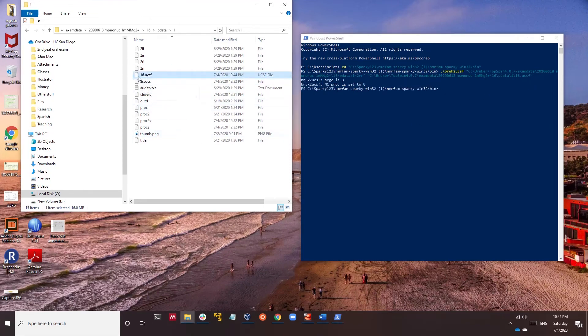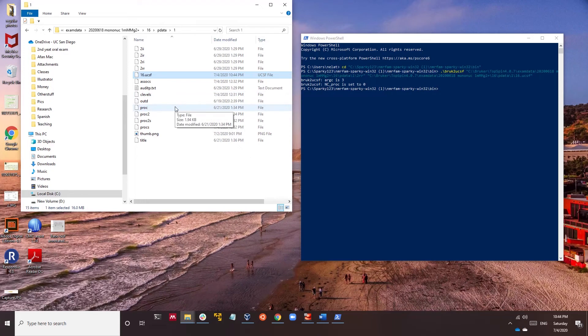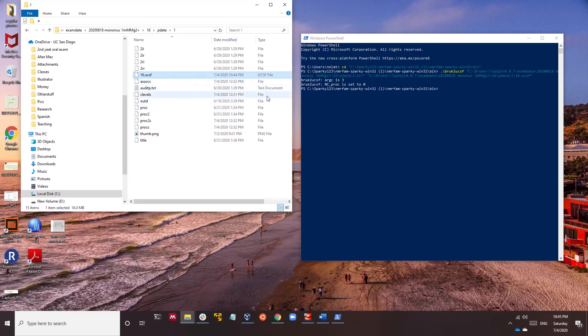Now you got the new one which is called 16.UCSF file. This file can be opened in Sparky in multiple windows. This will make it easier for you to open many different files. It can also be opened in CCPNMR2. And that's it.